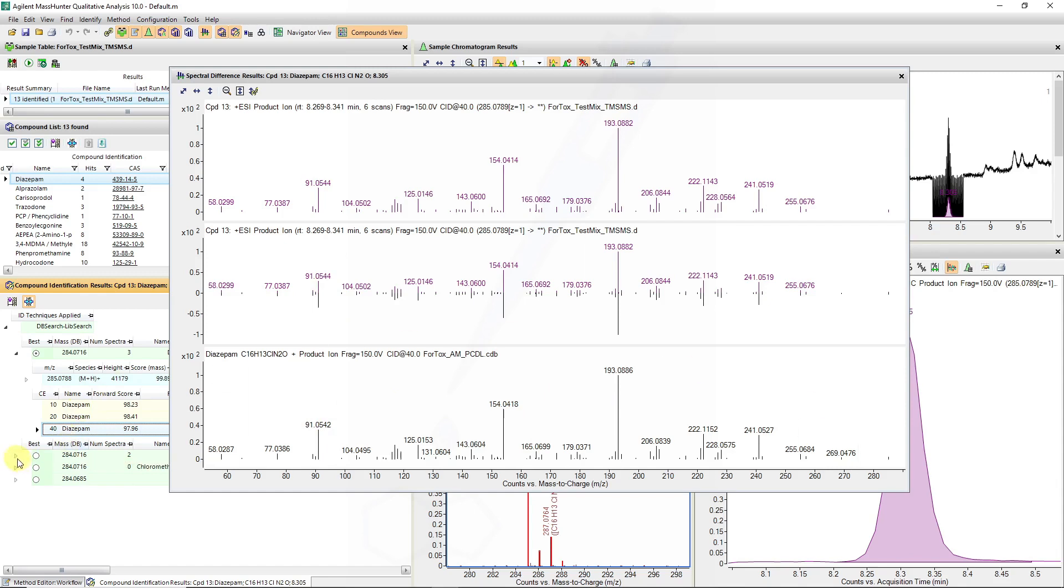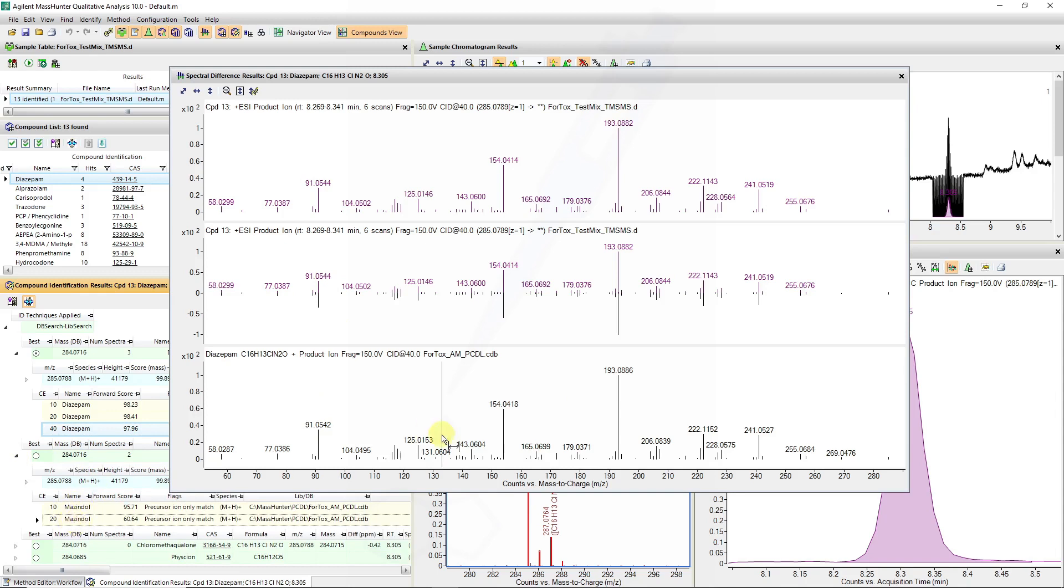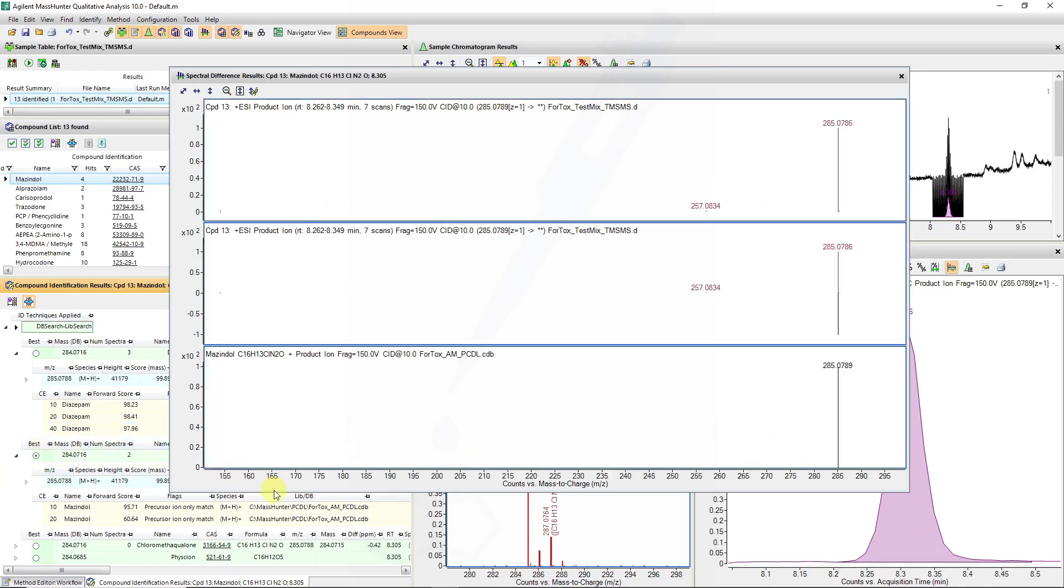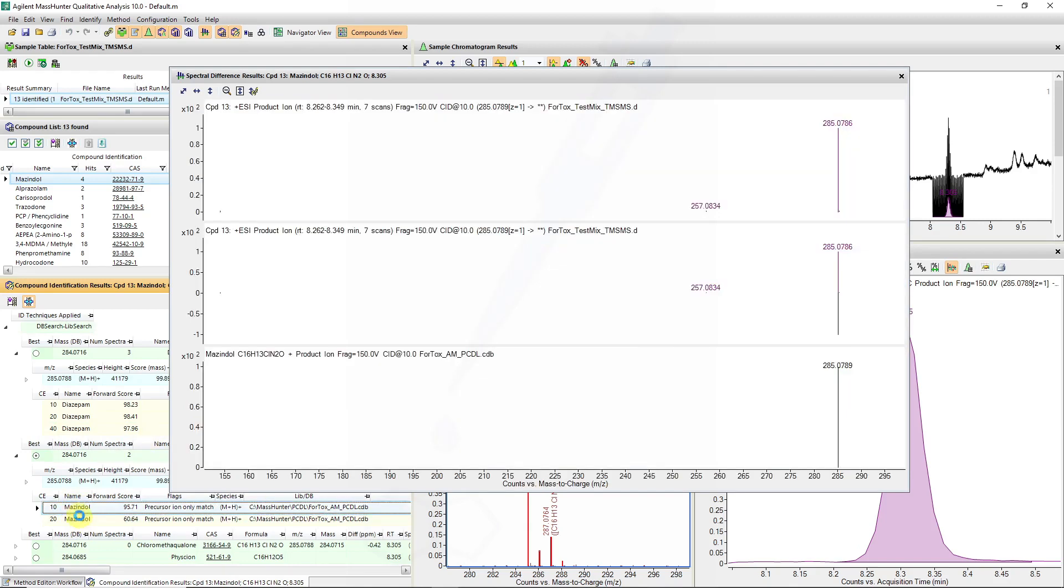If we look at some of the other results like Mazindol we can also look at whether some of these ions have been flagged. We do have to click that best icon and now we can look at Mazindol and we can try and compare just some of the spectra.